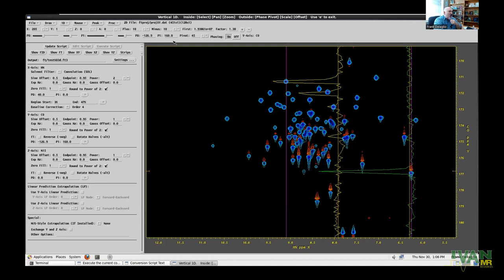And so one of the warnings about this is that it can be very difficult to choose first order phase corrections in the indirect dimensions of a multidimensional data set, especially for cases where the peaks in the data have mixed sign, positive and negative. And so this is one of several motivations to always set up the indirect dimensions of your measurements so that they have a well-tuned initial increment delay, so that the first order phase correction is either 0, 180, or 360, corresponding to no delay, half a point delay, or a full point delay.